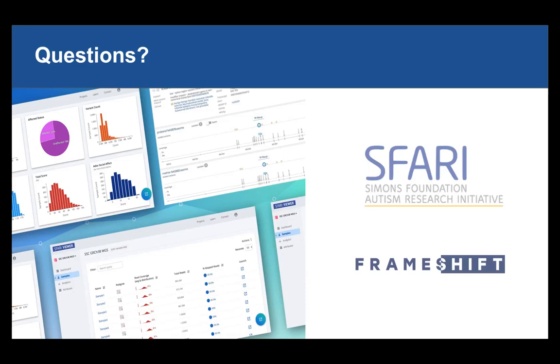So the tools that we showed allow analysis of an individual gene and really digging into individual variants within a gene or within a set of genes, and also the cohort gene for enrichment. But we also have a couple of tools, one that allows us to dig into an individual sample and really understand the sequencing coverage information and other statistics associated with whether or not the sequencing experiment itself was good.